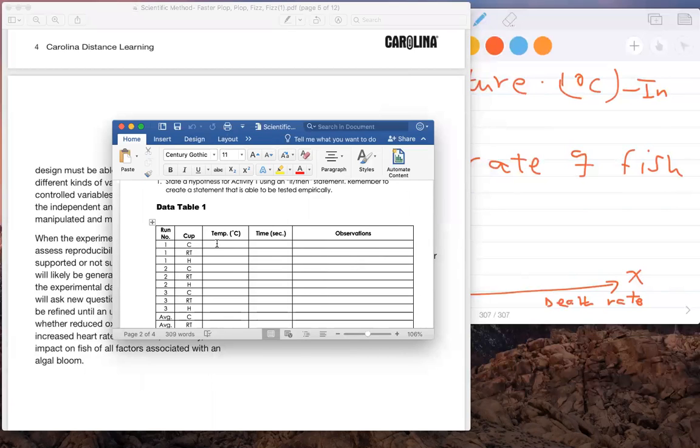How you're going to prepare your ice bath is you'll take your kitchen bowl and put ice and water in there, and then you will measure the water with no ice. I'm just going to put ice in here and put some water in here. This will be the ice bath.